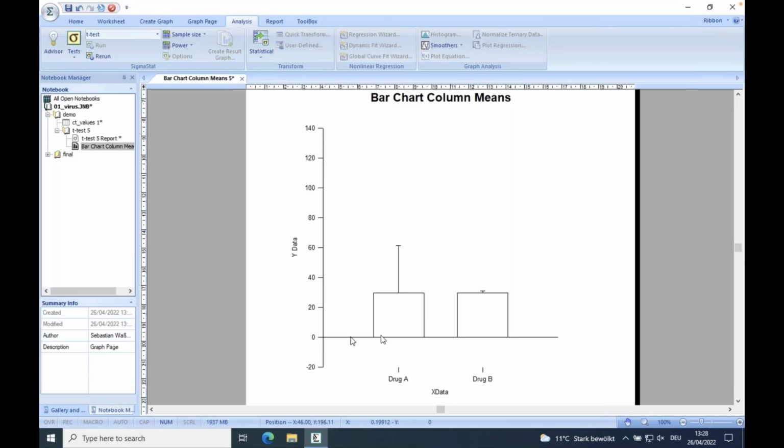And maybe you think, okay, this doesn't look nice at all. And maybe again, of course, the demo, so I have to click a lot. So I want to hide this. So yeah, you can use this mini toolbar. You see, it's maybe a bit tedious if you want to click on everything.